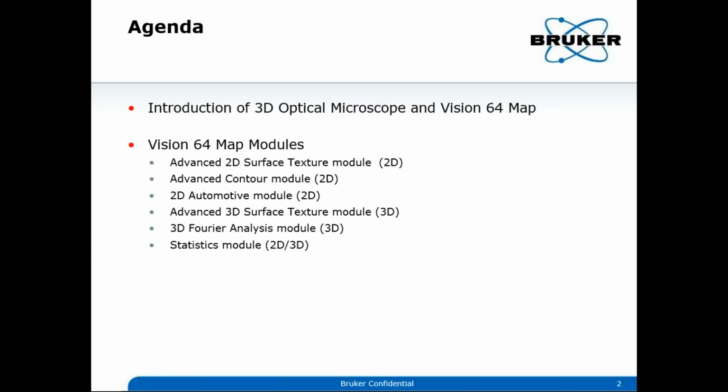So this is today's agenda. I will first do some introduction of the Bruker 3D optical microscope, and also later we'll do some introduction of the Vision64 Map. Vision64 Map consists of several modules depending on your applications. Some of the modules here should suit your needs.